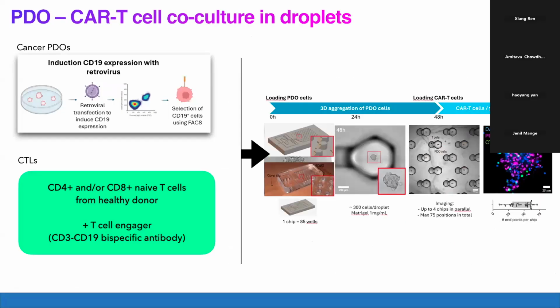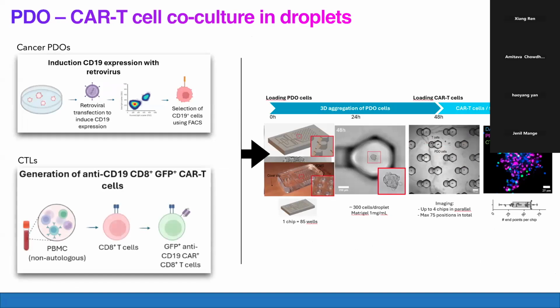And then finally, we can play another game. Well, it's not a game really. I'm sorry to say that. We can change our paradigm and use CAR T cells, so these T cells that were engineered to actually recognize CD19 directly.